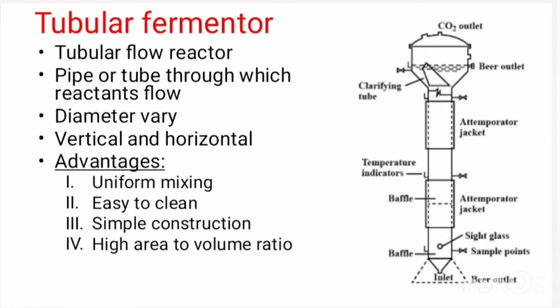There are several advantages for the tubular fermenter, that are uniform mixing, tubes are easy to clean, simple construction, and high area to volume ratio.